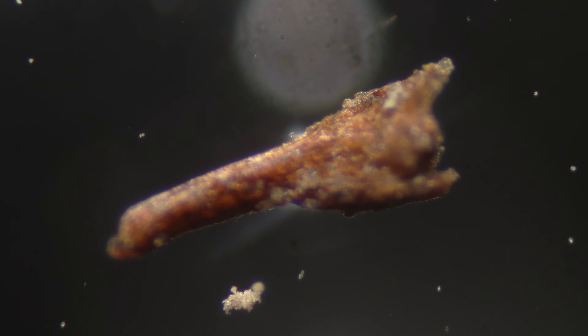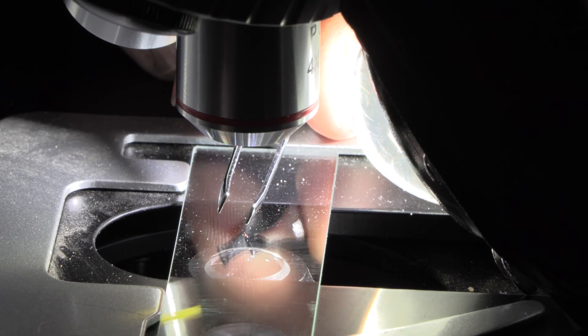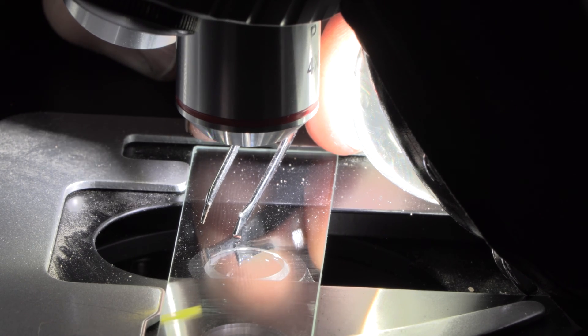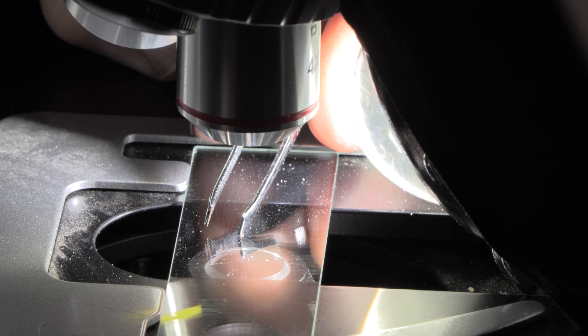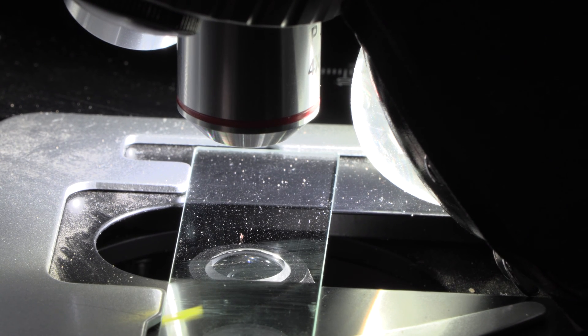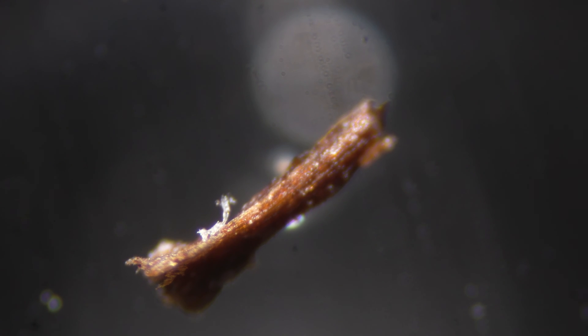It looks like those came out with it — I don't know if those fell on their own on the slide or what. I'm going to work with a really steady hand here and try to flip this thing over on its back. It's got to be the smallest splinter ever. I'm thinking this wouldn't even be able to penetrate an adult's skin. This is going to be a side profile of the splinter now — who thought I would be sitting here looking at a splinter under the microscope.